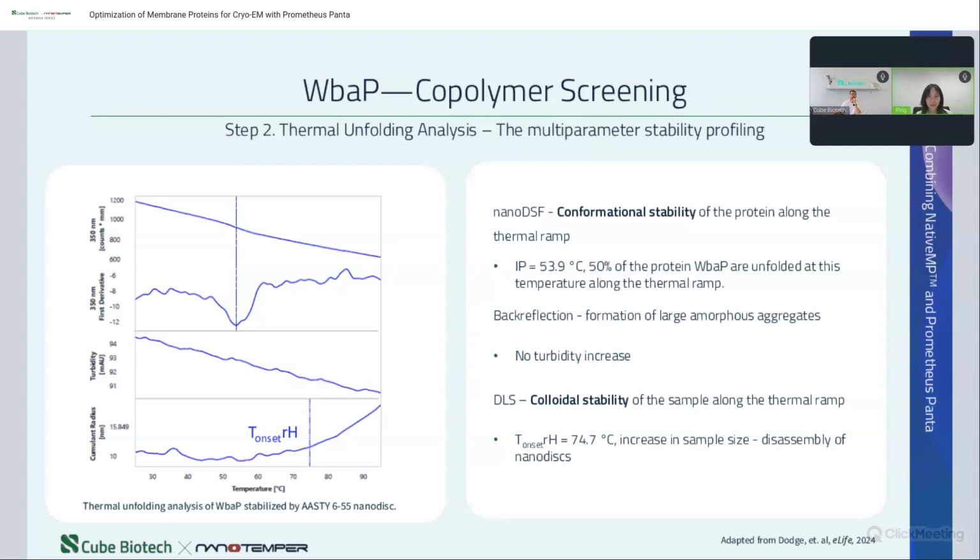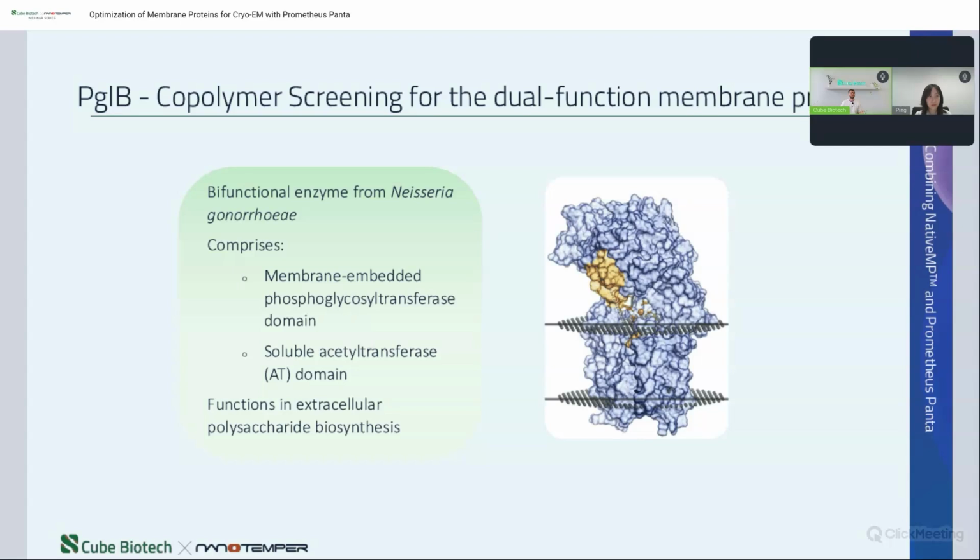Yeah, that's absolutely right. We really have to remember that the most successful results come from this broad initial screening. I cannot emphasize this enough. This is then followed by systematically narrowing down, step by step, like Ping is describing here. The more options to choose from, the higher the success rate is in the end, especially when your timeline is strict. If you want to get to the structure fast, it's always better to have 5 options than 1, right? So that was our first example, already very insightful, but it's not everything we have to show you, because now we're going to continue with an additional case study, and that's going to further highlight how these systems are working.